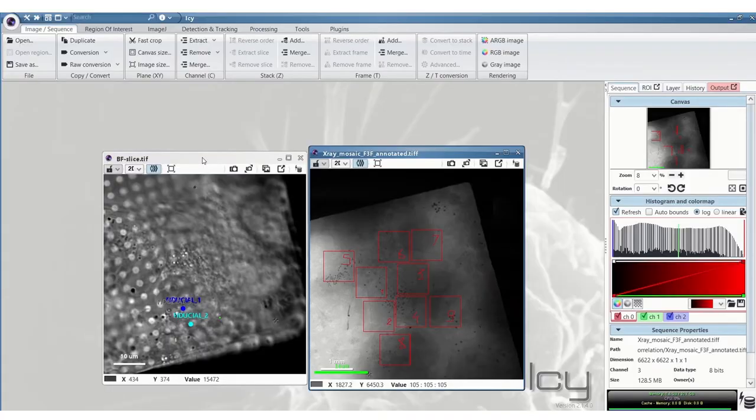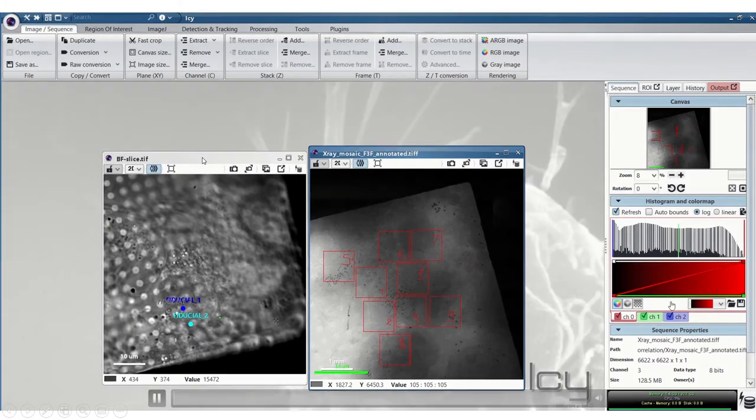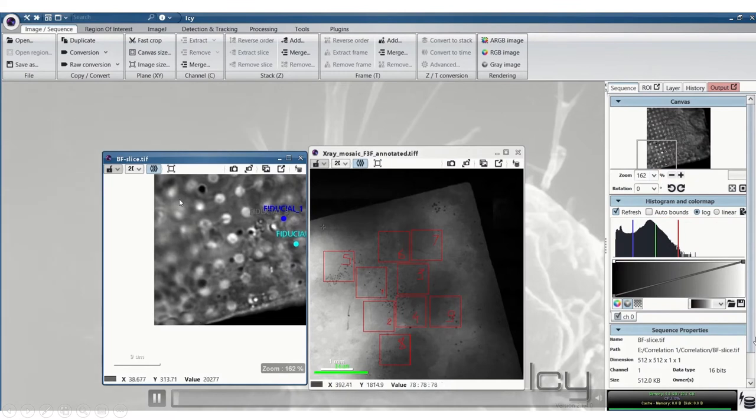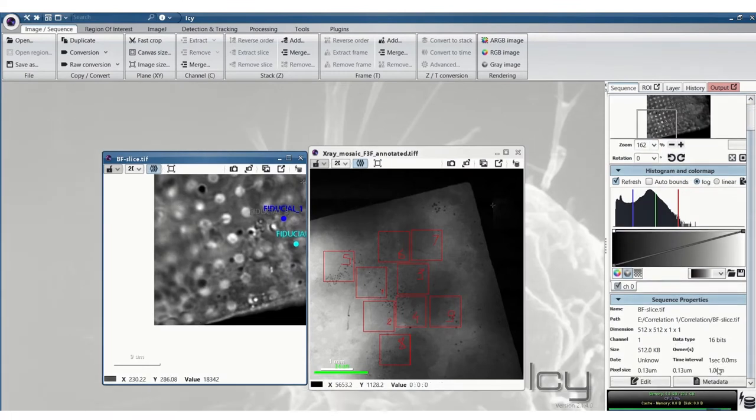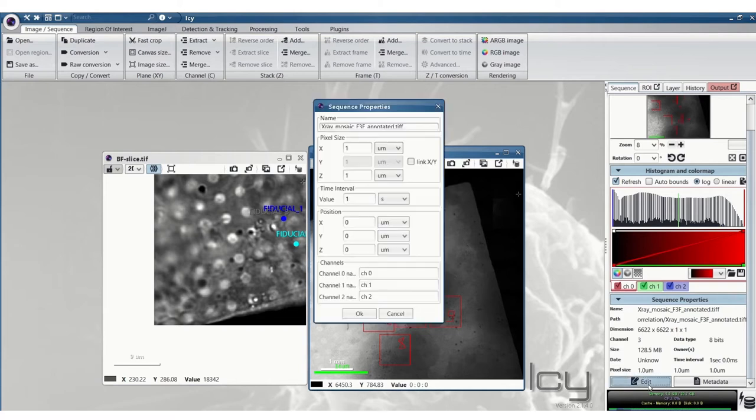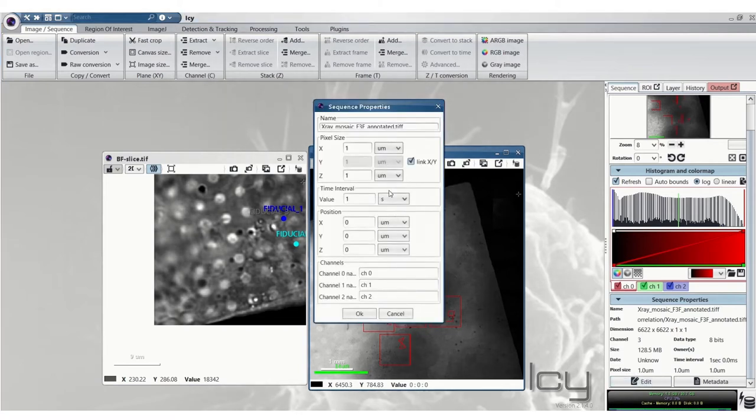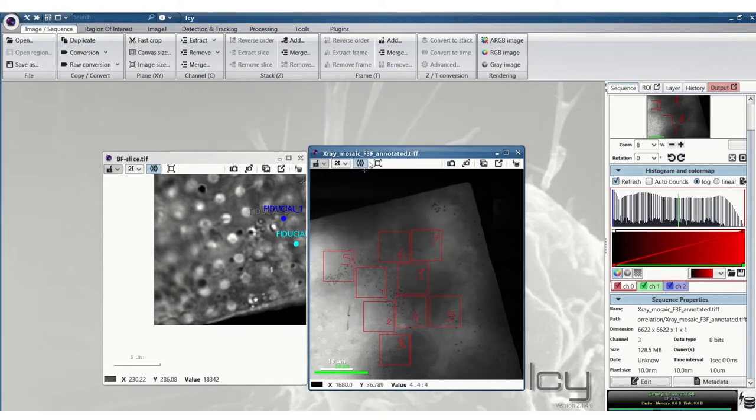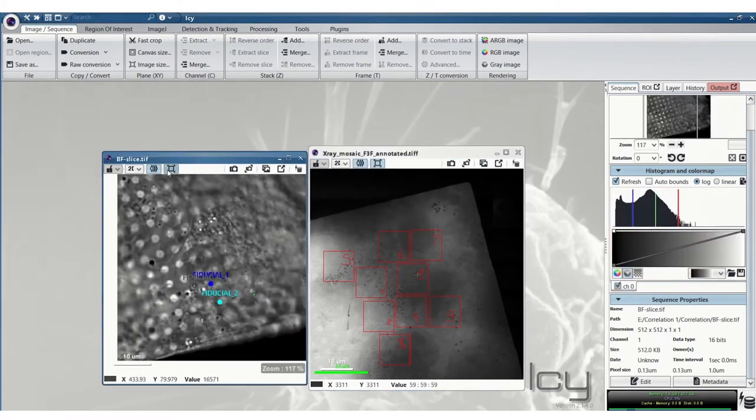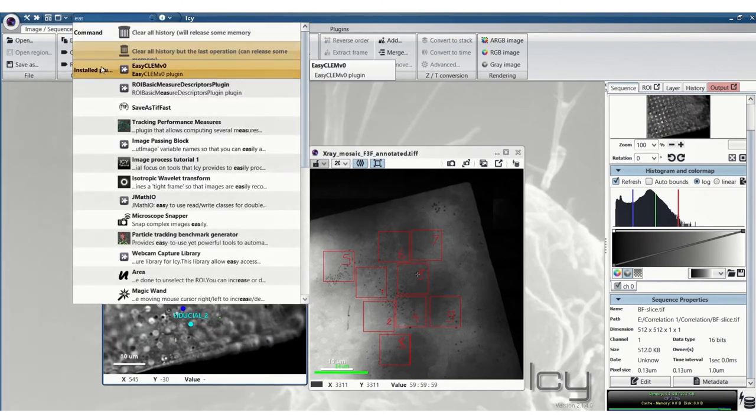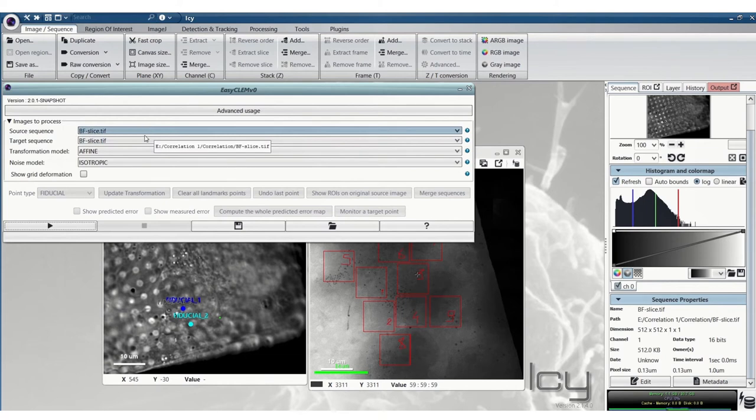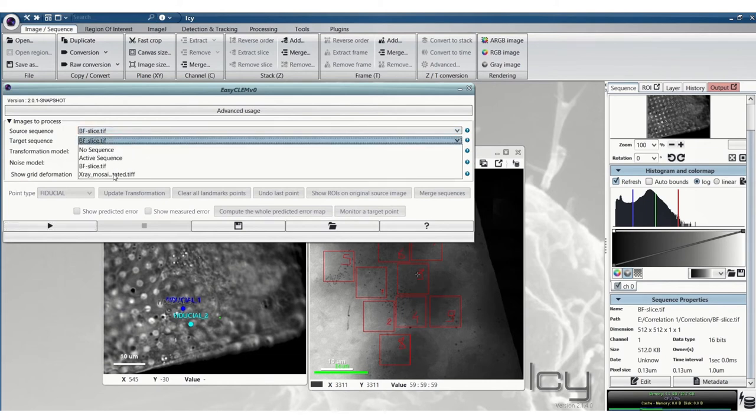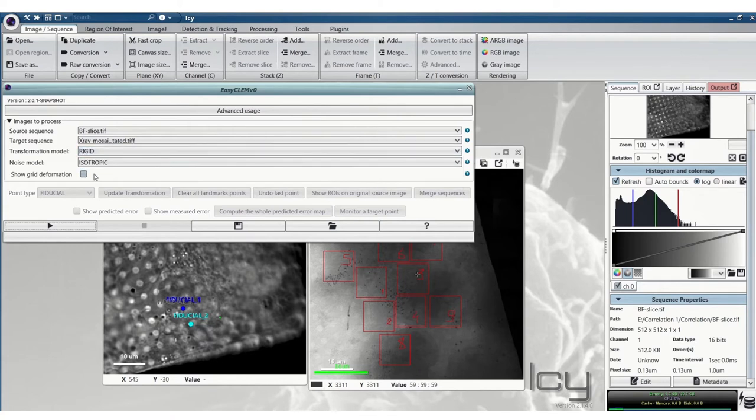Now I'll do this with the brightfield and the X-ray mosaic images. So here for the X-ray mosaic you can see the pixel size is wrong. In this case it's 10nm so we'll change that. Because these are our 2D images we only need to worry about the X and Y in this case.